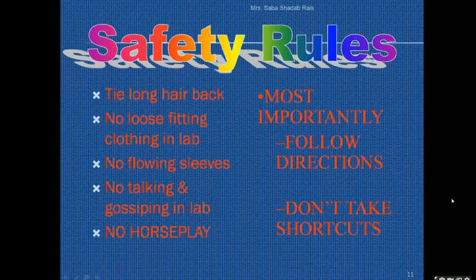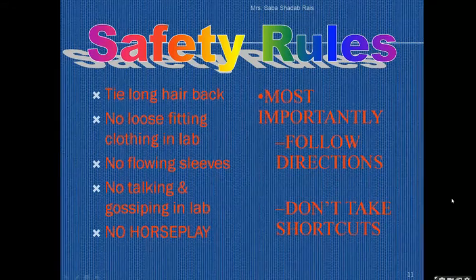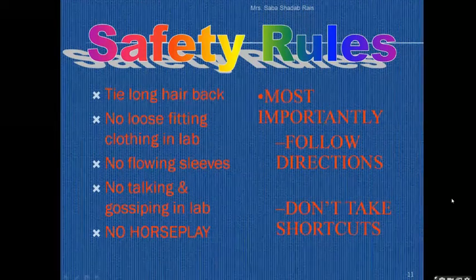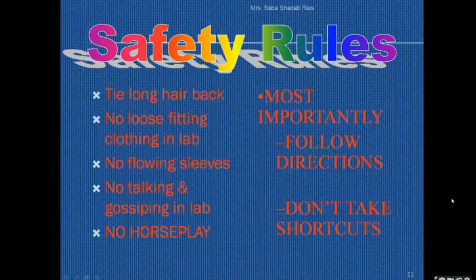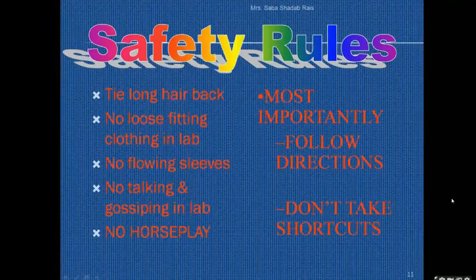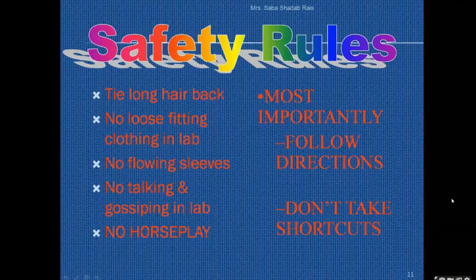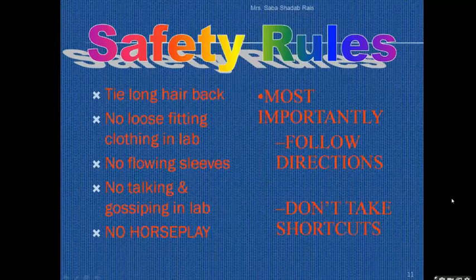Then eating food is not allowed. You will not dare to do it in the laboratory. You should not talk and gossip in the laboratory. No horseplay. You should not run. Then wash your hands properly before leaving the laboratory. It is a very compulsory habit you need to develop: whenever you are going out of the laboratory, make sure that before leaving the lab you wash your hands.